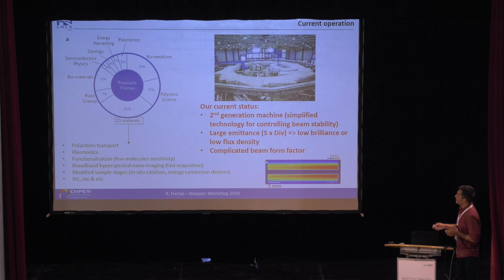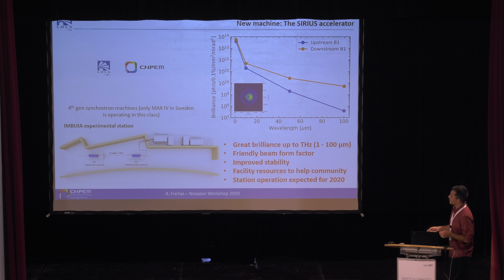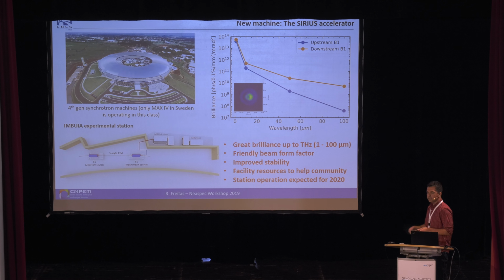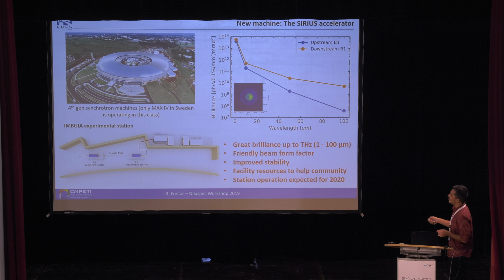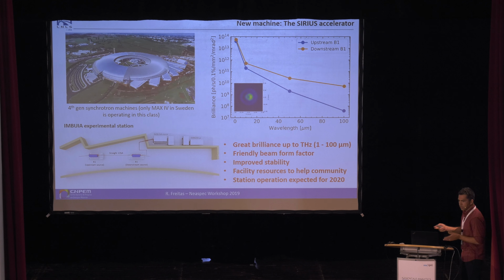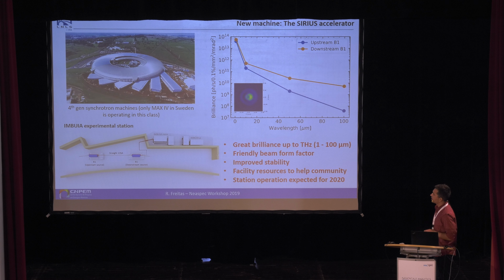Okay, so just finishing with a few slides here. We have a machine that's already considered old, and the form factor of the beam is not so attractive. We need to cut the beam to enter this microscope. So the point is that there is some room to improve if we think about new machines that are coming. We are constructing a new machine in Brazil, which has a different technology for these accelerators. Basically, it's a more stable machine. And we're going to try to push this range up to the terahertz range and explore this source more in a range that lasers are still not covering continuously. So this is something that we are planning.